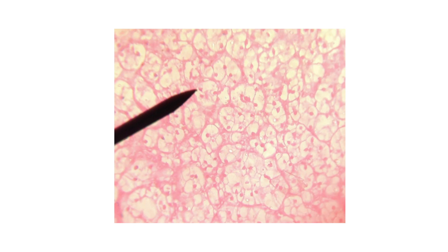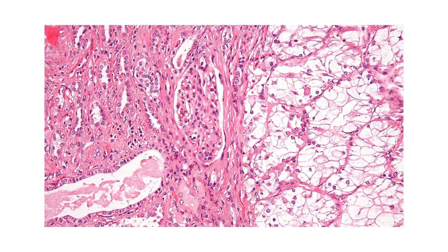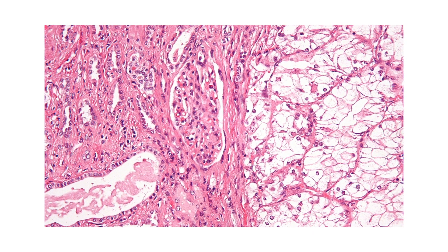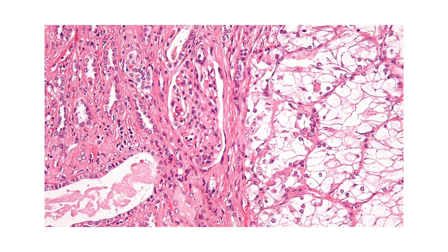The tumor cells are arranged in a very delicate fibrous stroma. Because of this, they can adopt multiple arrangements. Commonly they are arranged either in solid configuration, acinar, or tubular. Here in the picture we can clearly see the acinar arrangement of the clear cells.